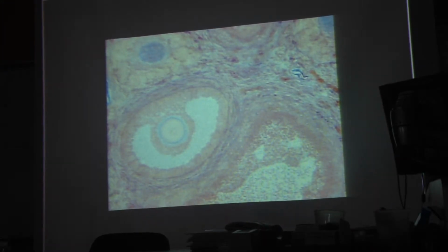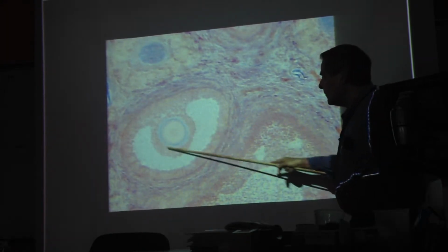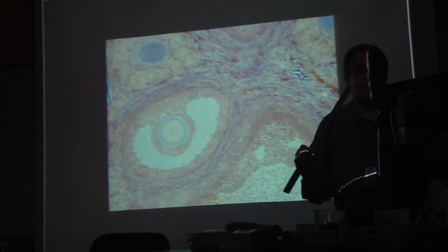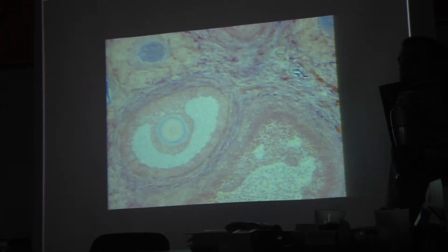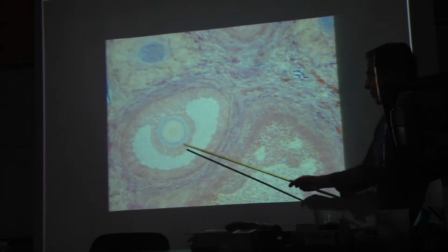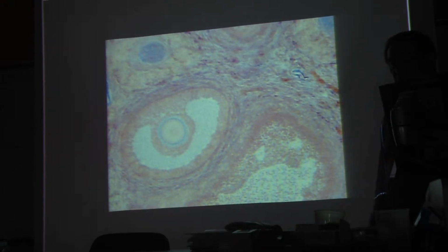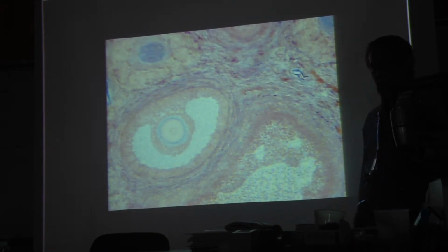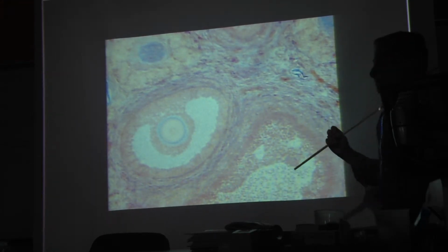That's the antrum. And here is the egg cell again. It's called an oocyte. There's a nucleus and cytoplasm. These are the membranes around it, the zona pellucida, and a group of cells of the follicle that remain with the egg. What are these cells called? The corona radiata. Remember, a sperm cell has to penetrate the corona radiata and the zona pellucida to get into the egg cytoplasm to accomplish fertilization. That's why sperm cells have digestive enzymes in the head and that acrosome, to literally digest their way in through these barriers to get to the egg cell.